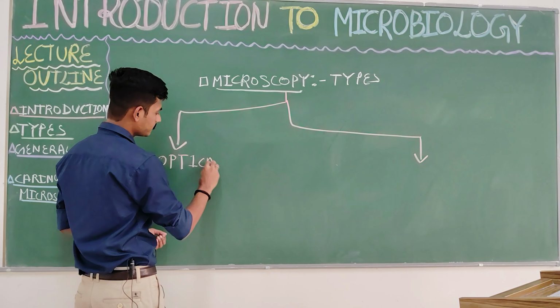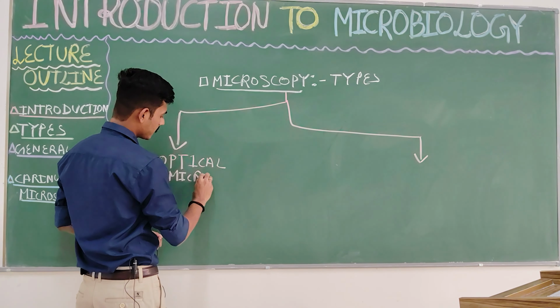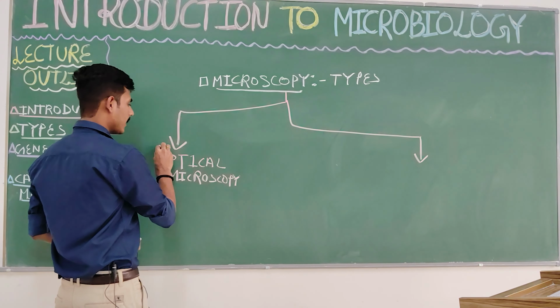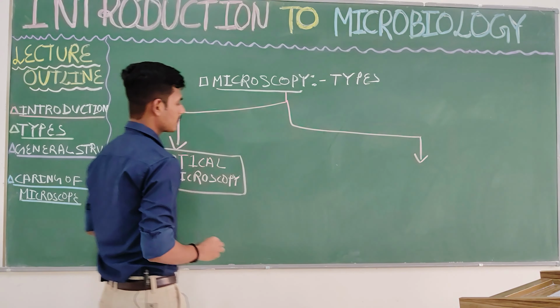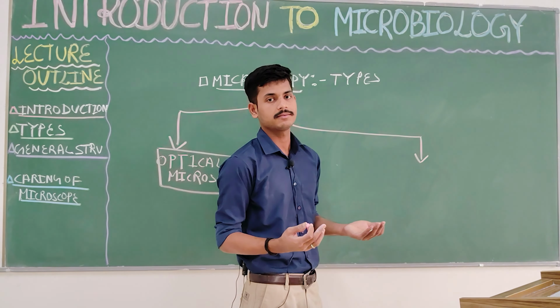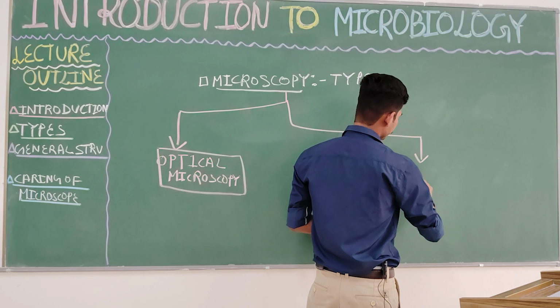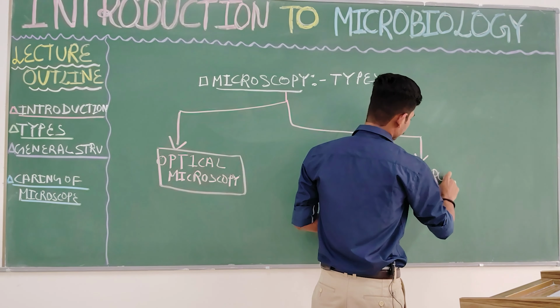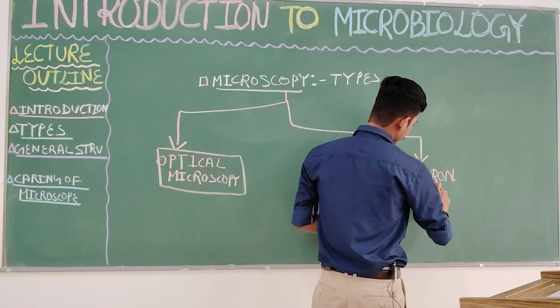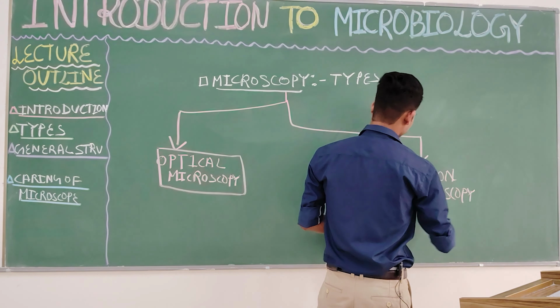Optical microscopy. And the other class is the advanced microscopy, the advanced microscope called the electron microscope. Electron microscopy.